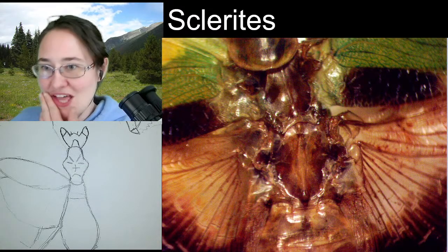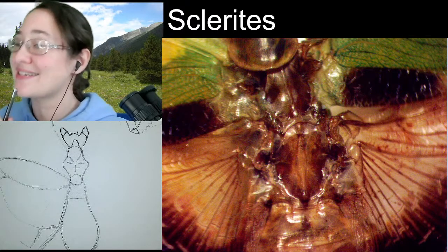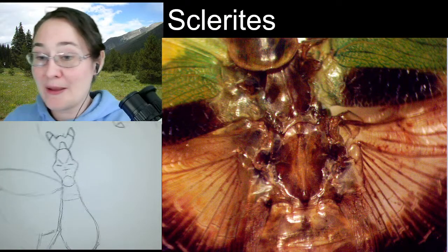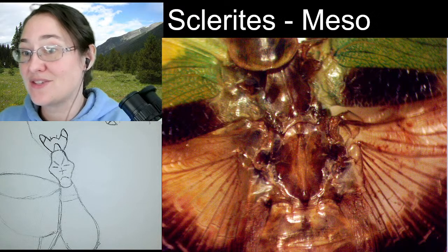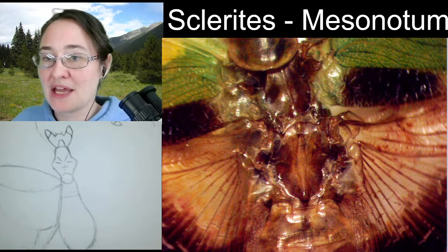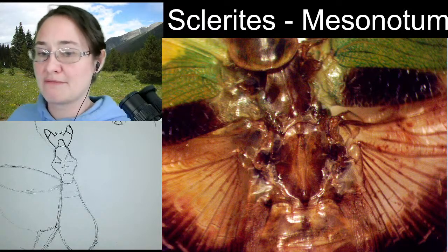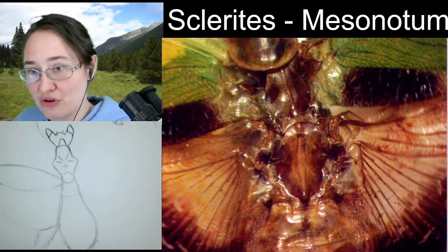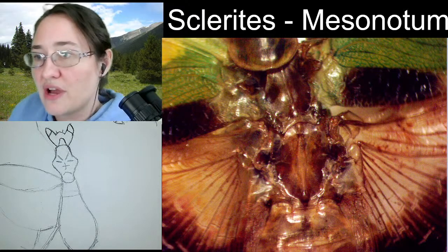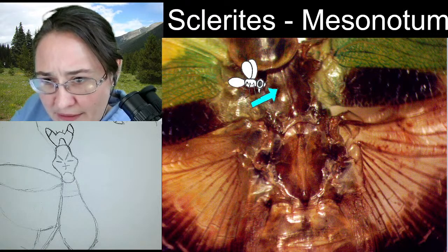So if we look at the sclerite on the top of the second segment of the thorax, we might call it the mesonotum, all right? Because that would be the notum, meaning on the top of the buggy, and meso, meaning the second segment of the thorax. It's right here. It's this one, that plate.